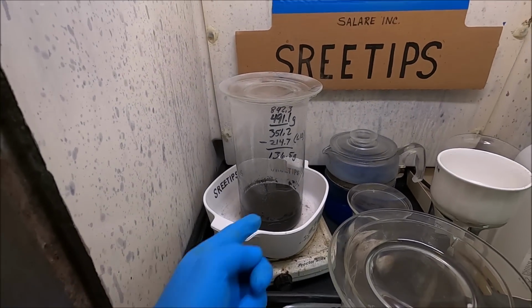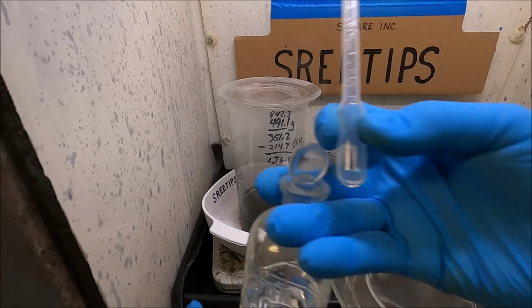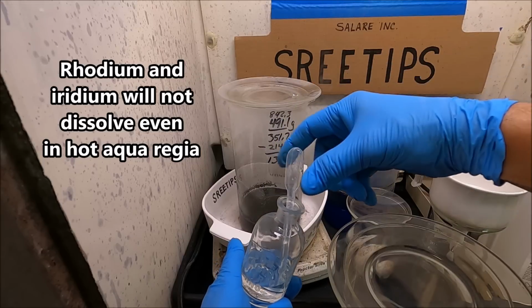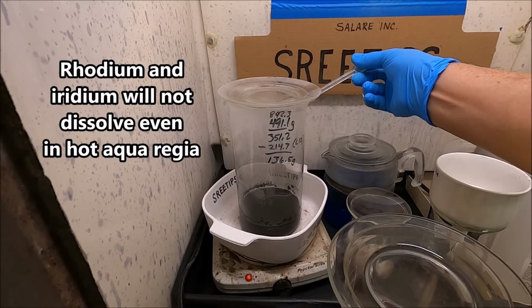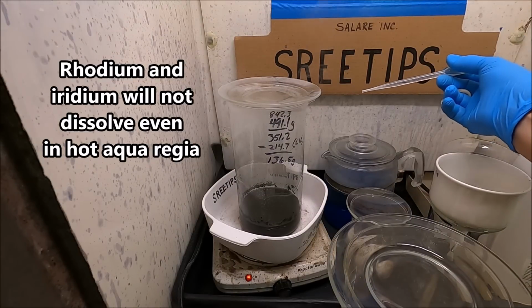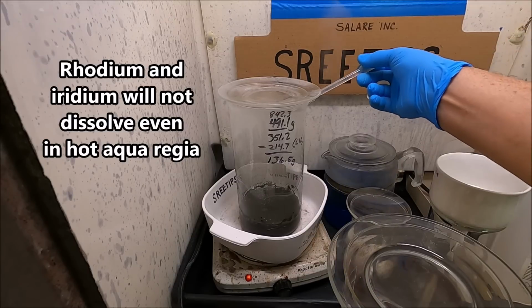This is the second extraction of our solids. I'm going to add another squirt of nitric acid. Do it real slow here because this is boiling. Just add a little bit of acid. That's nitric acid going in.